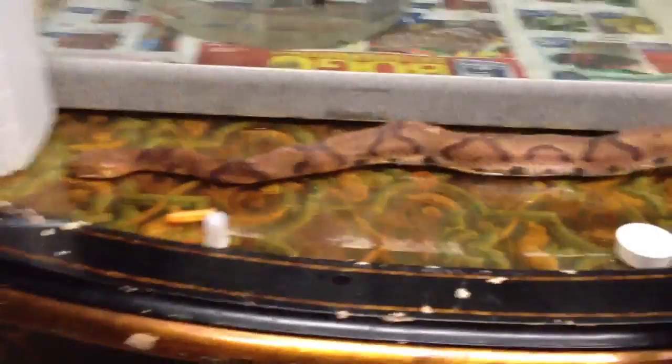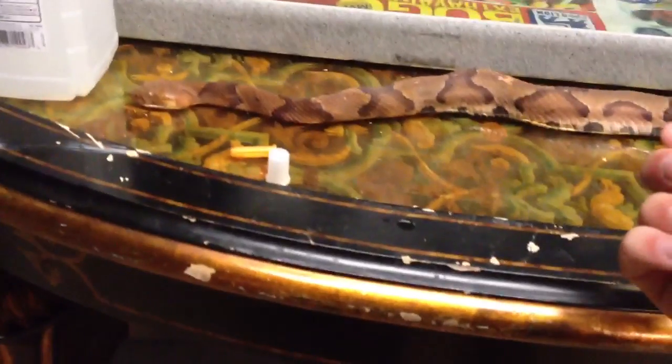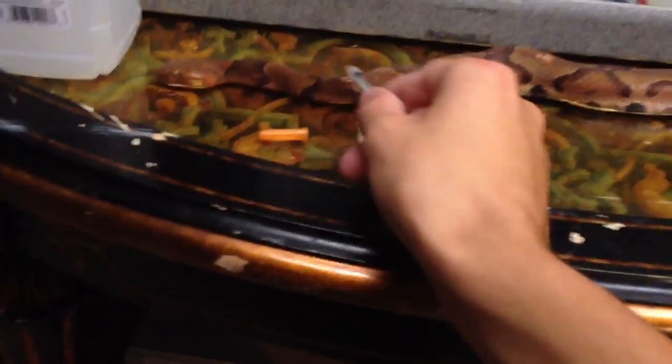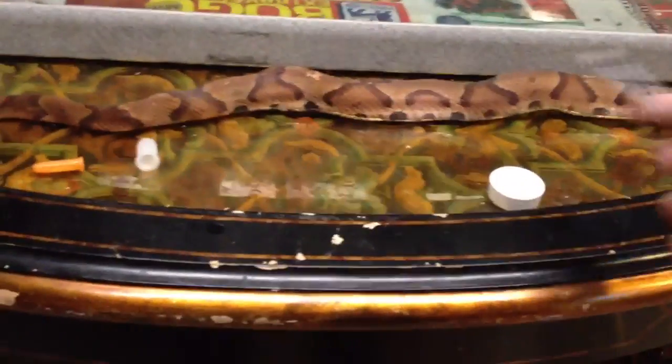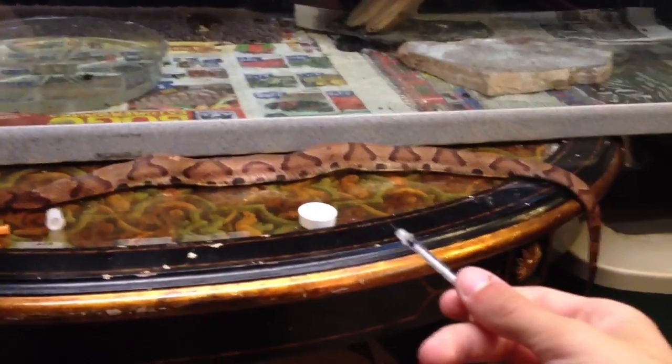What you want to do with that is, for a bigger snake like this — you wouldn't have to do this for a smaller snake, so just ignore this part if it's a smaller snake. You want to inject rubbing alcohol into every three inches of the snake, or just wherever you feel safest. I do every three inches on each side of the body for a snake this size — it's probably 32, 33 inches.